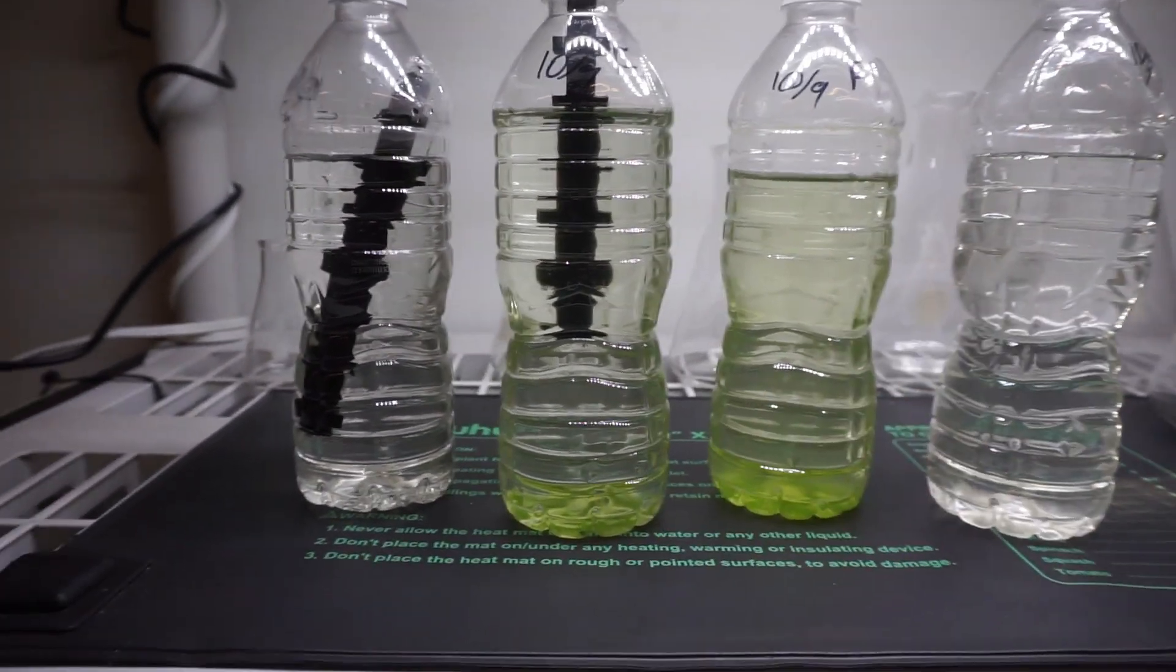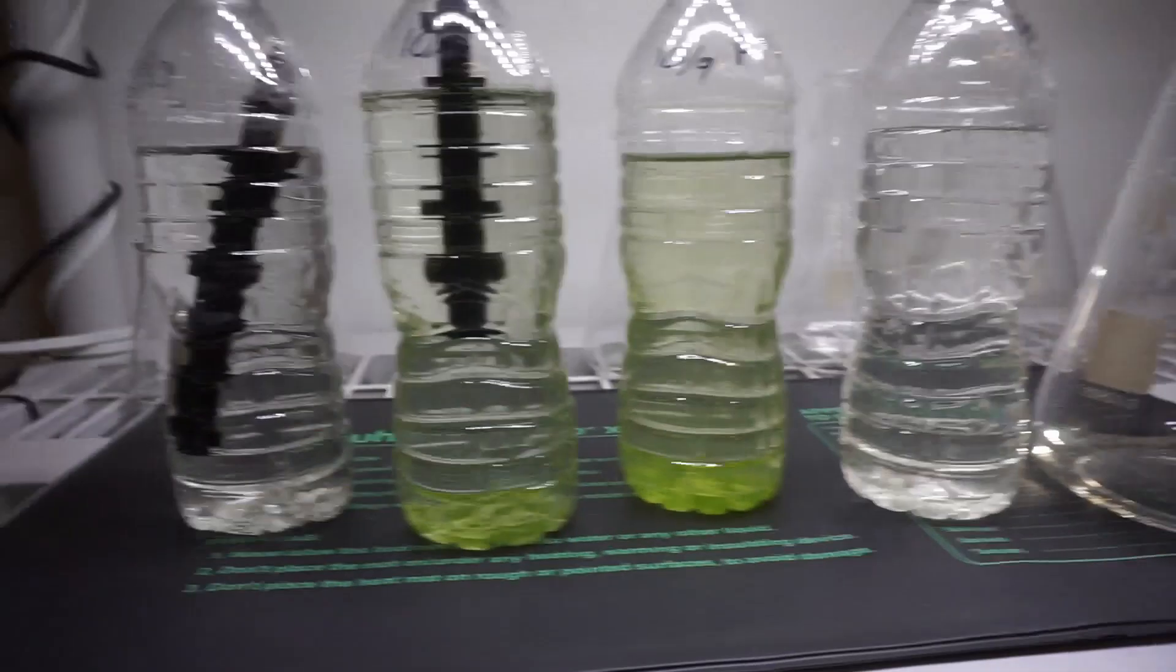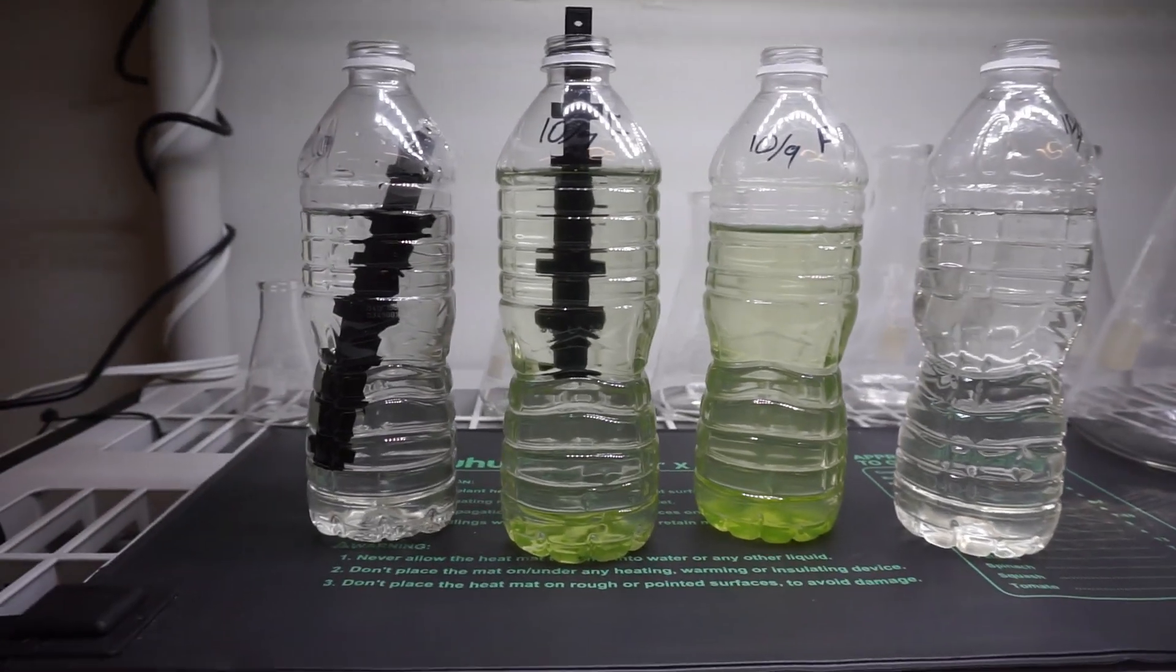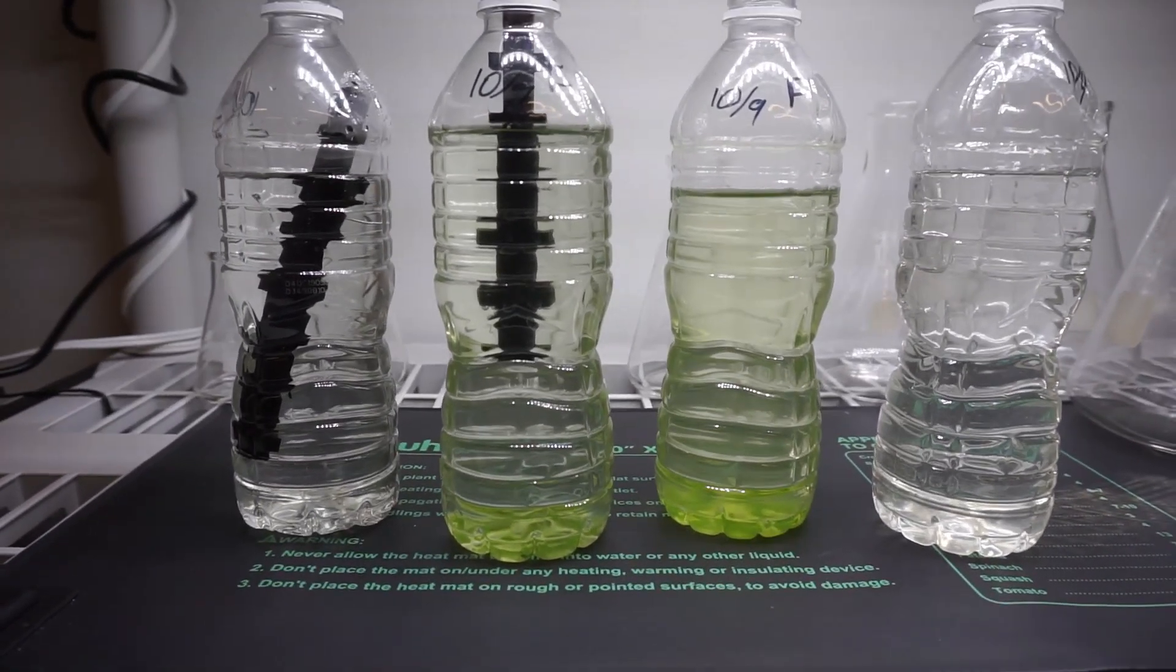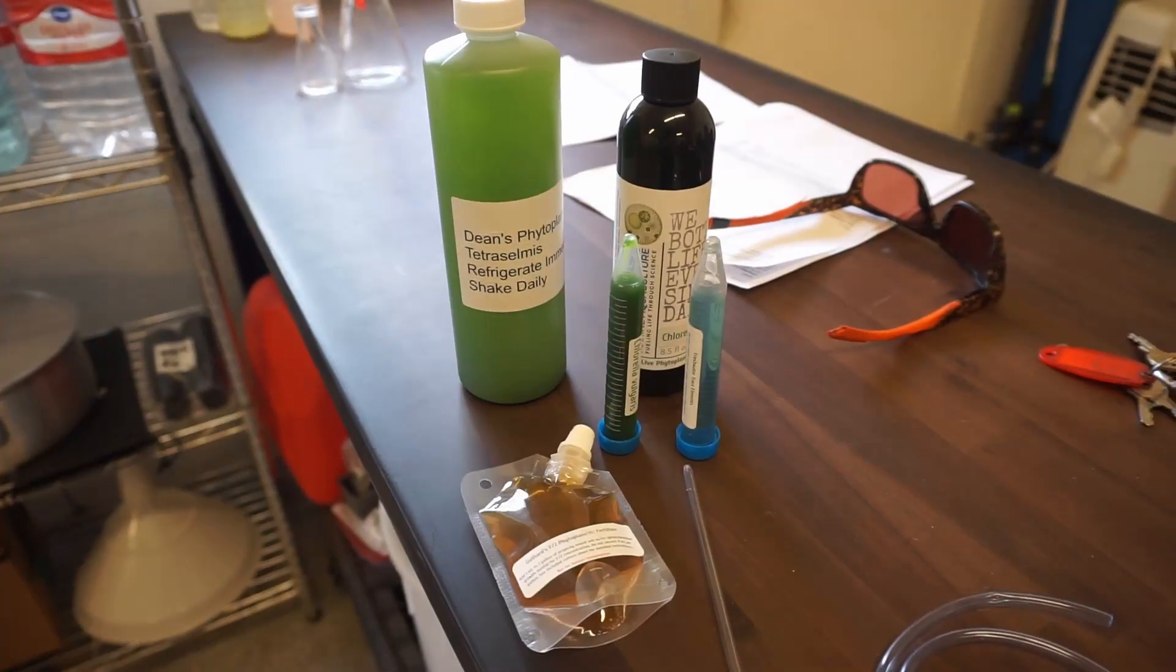But after next week we'll go ahead and put them in a thousand milliliter container together and let them continue to grow up, and then we'll put them in one of the one gallon carboys. So I just wanted to do a quick update - this is one week.